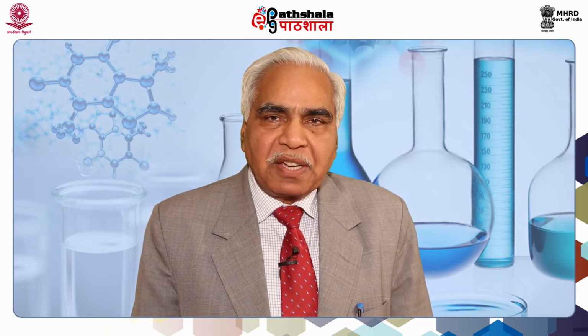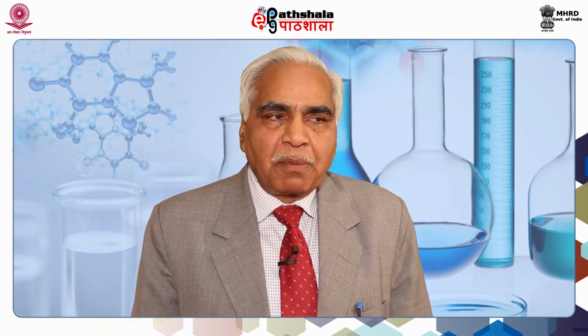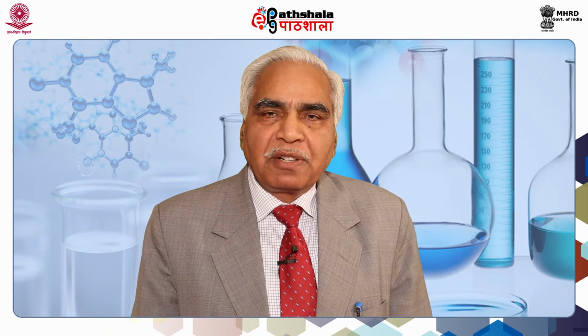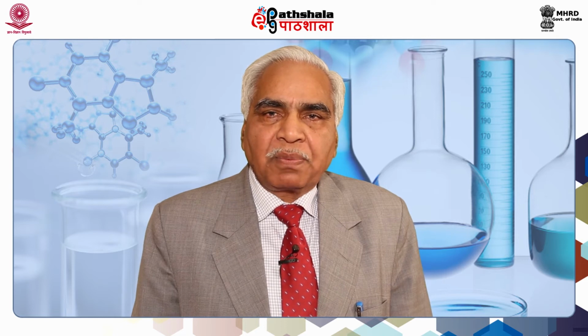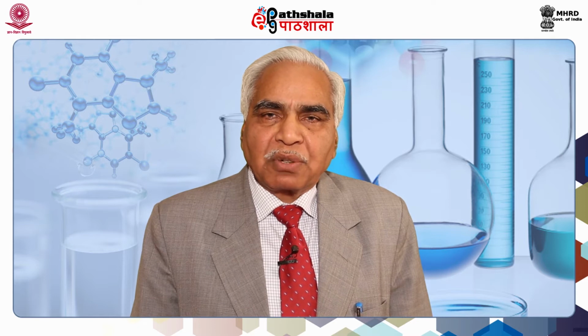Today, I will be teaching you one of the very important techniques of isoelectric focusing. Isoelectric focusing is a technique which is used for separating two molecules which differ in their isoelectric point by as little as 0.01 pH unit. This technique is basically used for identification of unknown protein molecules by measuring their isoelectric point.